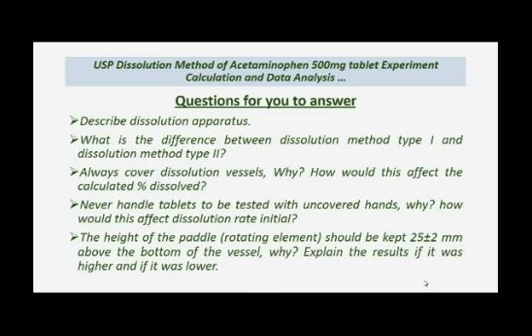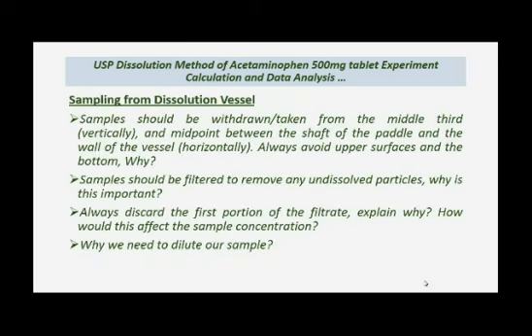The height of the paddle rotating element should be kept to 25 plus minus 2 mm above the bottom of the vessel. This should be done to maintain the paddle away from the tested tablet, and also not to touch the walls of the vessel, and both things will cause problems during dissolution.